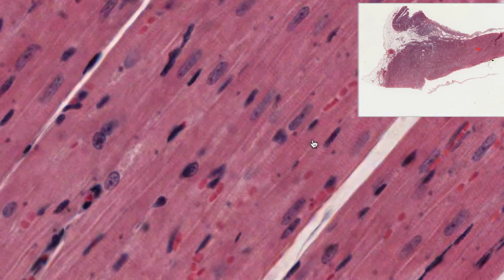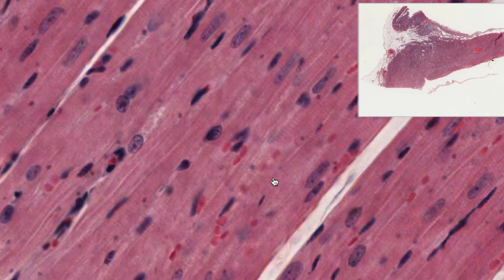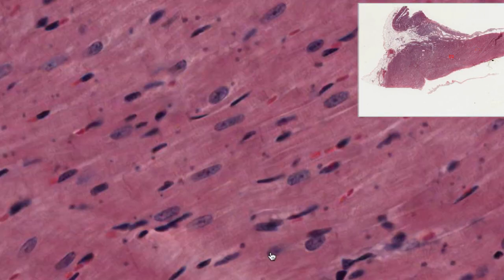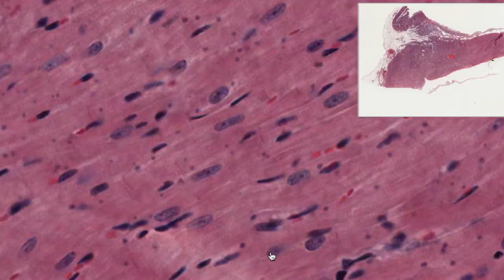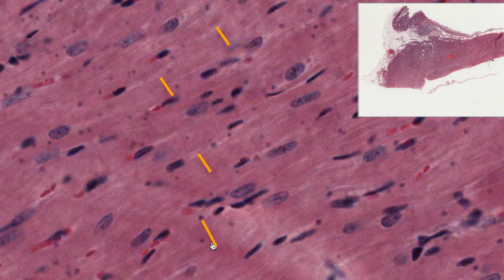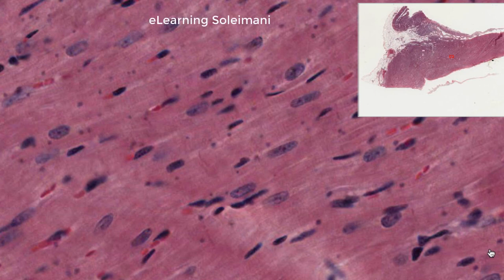Cardiac muscle is both striated and involuntary. In this view, intercalated discs are visible, which consist of junctions between the cardiac muscle cells, including gap junctions and desmosomes.